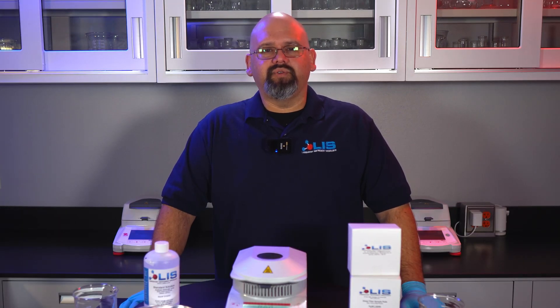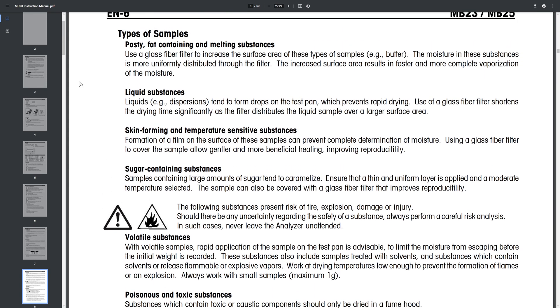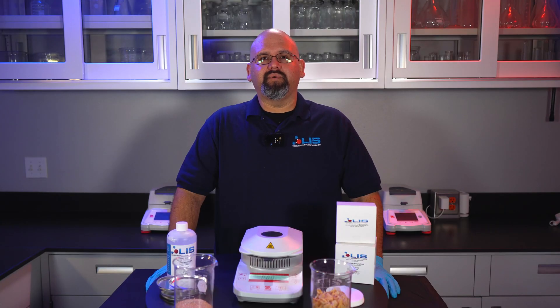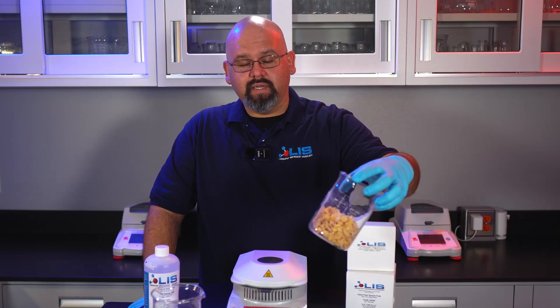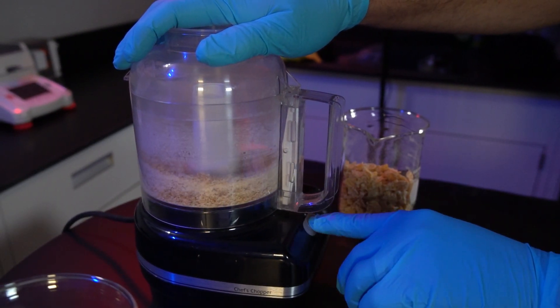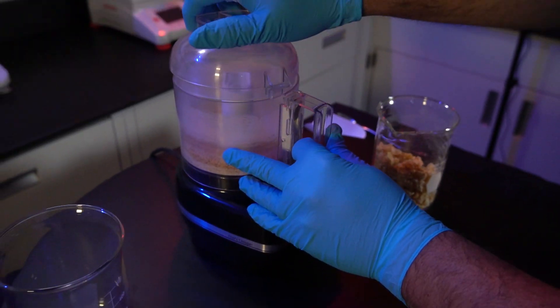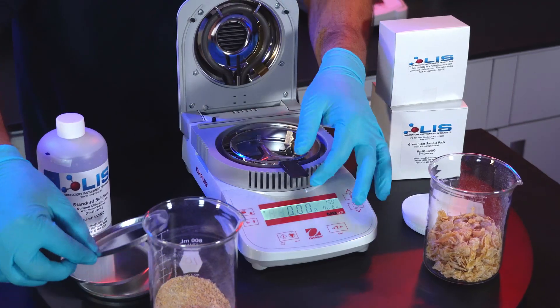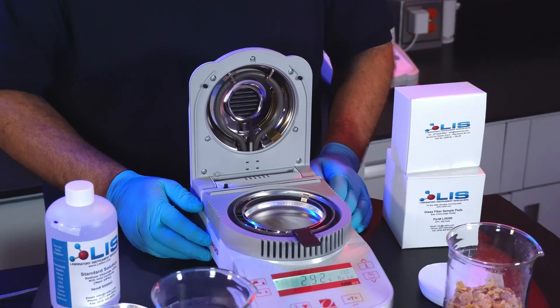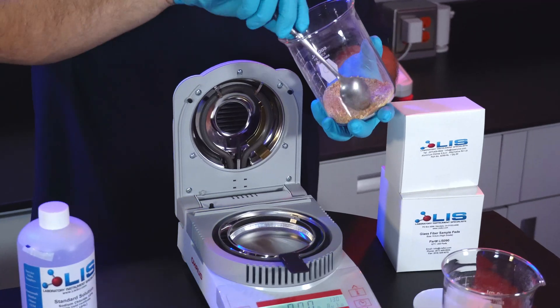Now we'll do some sample tests. Do keep in mind, to keep test results consistent, I highly recommend there be a set standard operating procedure in place. Please refer to the Types of Samples section on page EN 6 of the MB-23 Operation Manual for further details on how exactly to test the different substances. The first sample we'll be testing is a dry food sample, which is a cereal. It is highly recommended to blend any dry type of sample such as grains, cereal, nuts, etc., using a blender, grinder, or food processor in order to achieve the best test results. Grab an aluminum dish and insert it into the sample holder. Make sure it sits correctly on the sample pan. Press the tear button to zero out the dish. Once it reads zeroes, grab your sample and apply evenly on the dish.